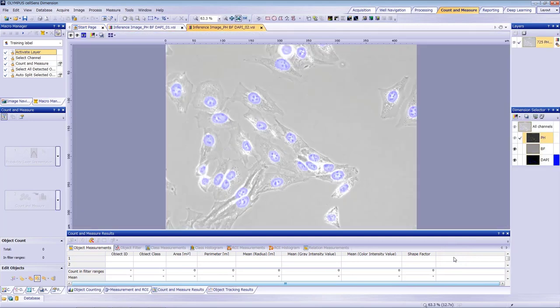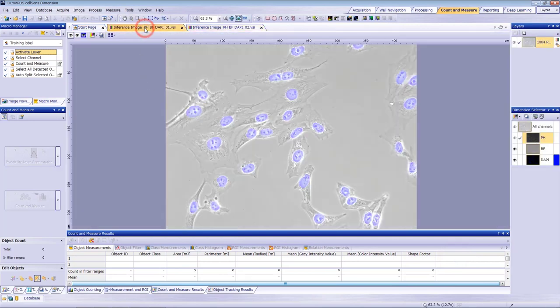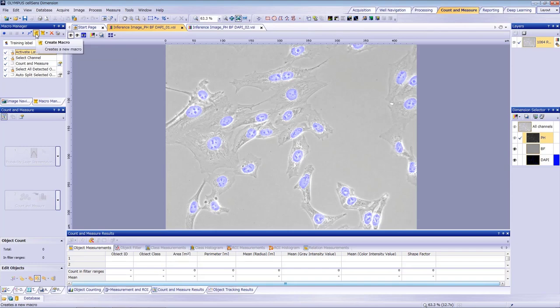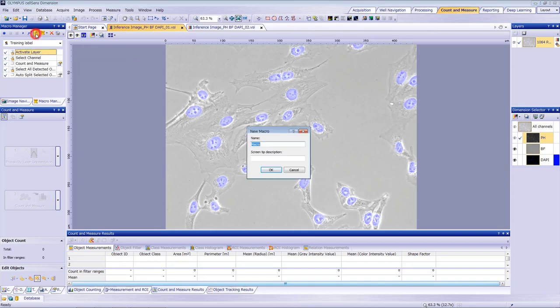Apply the neural network to the phase contrast channel to infer nuclei. Then apply the count and measure function to the inferred nuclei to count them. Record this process as a one-click macro. Disable toggle batch macro if needed and click create macro. Define the name of the macro and start recording.